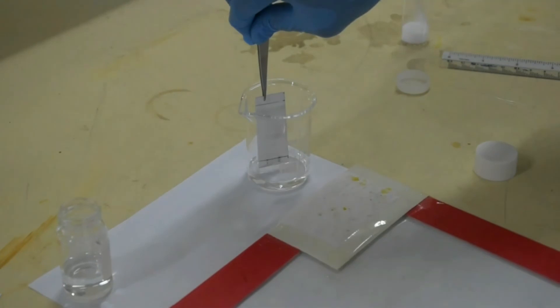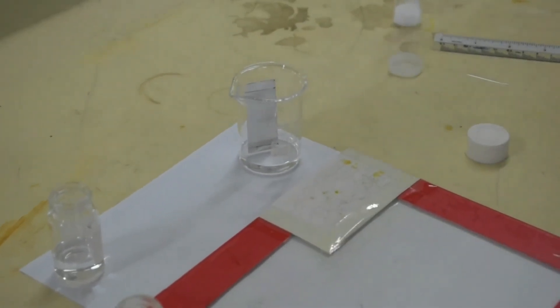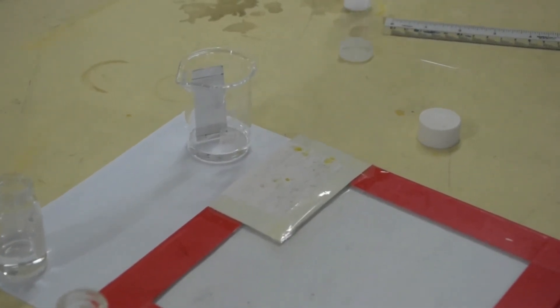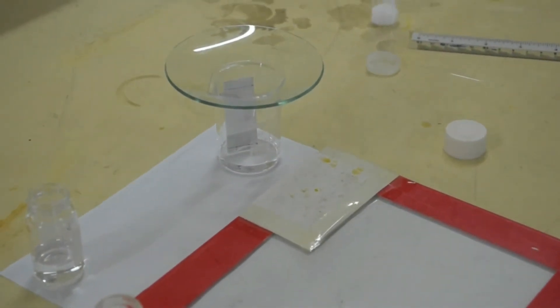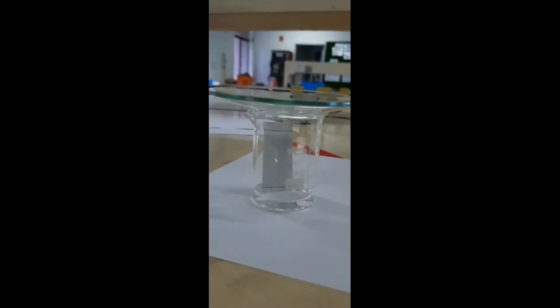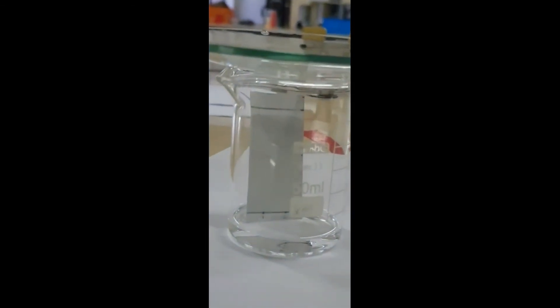This is the TLC plate after spotting the product and diethyl maleate. Put the TLC plate into the beaker containing the eluent. Observe the development of the eluent on the TLC plate.